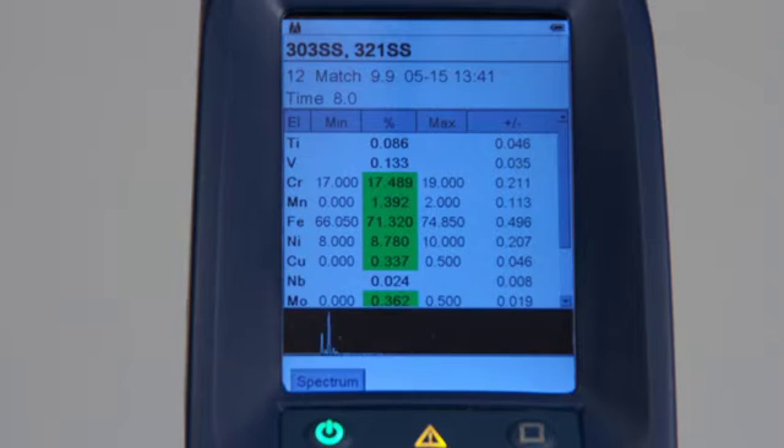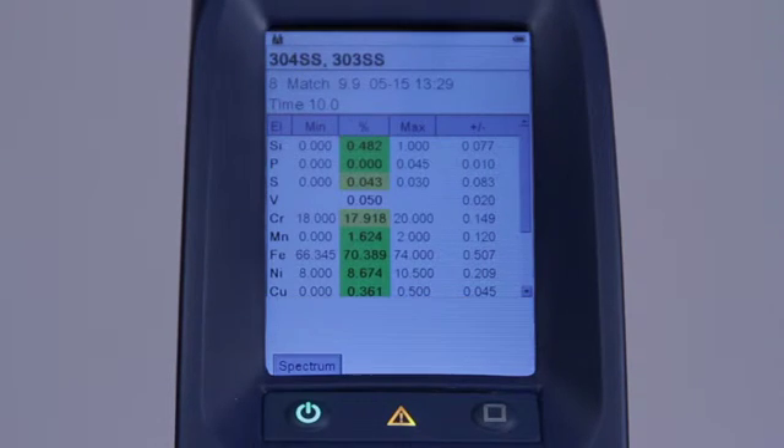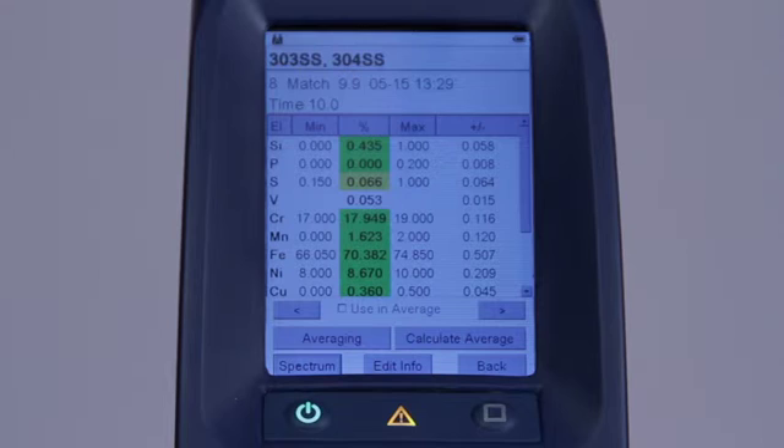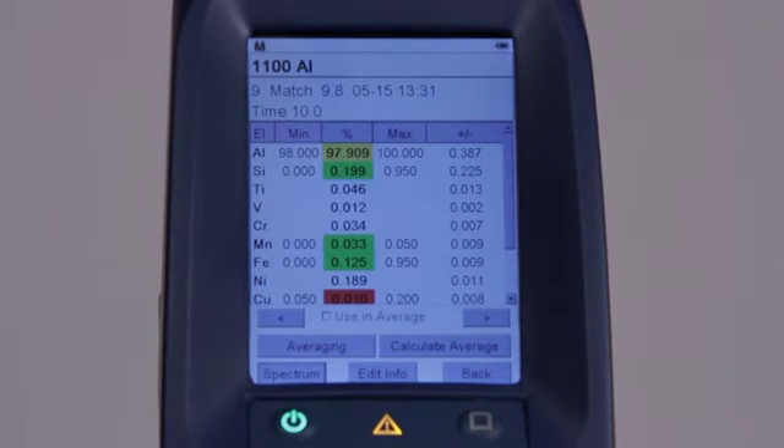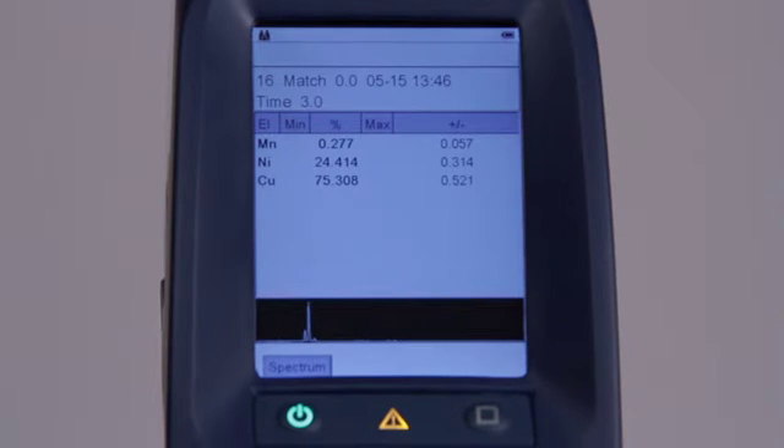When an element is defined within a grade, the analyzed value for that element is compared with the grade limits. When the assay is within the grade limits, the assay will be highlighted green. If the assay is outside the grade limits but within the range defined by adding two times the standard deviation to the grade definition, the assay is highlighted in yellow. If the assay is outside of the range, even when considering the standard deviation, it's highlighted in red. If the display setting is none, the display will be similar to the above but without the grade ID on the first line or the grade limits in the second and fourth columns. In addition, no color codes will be applied to the assay.